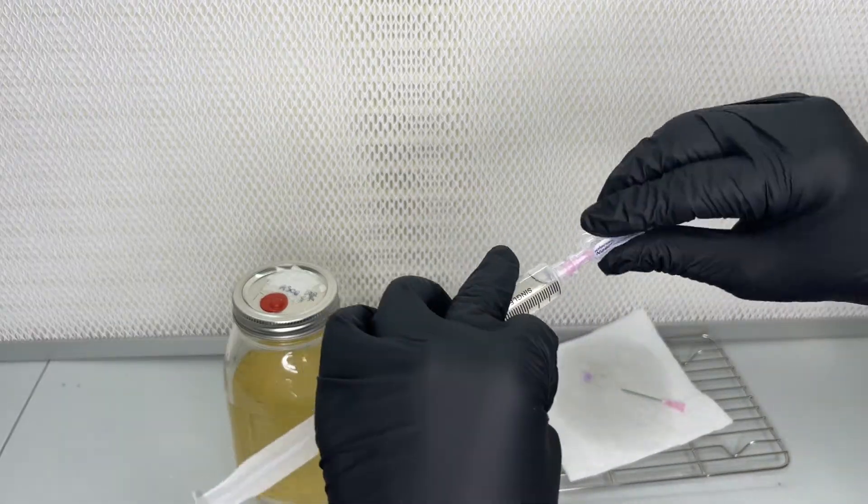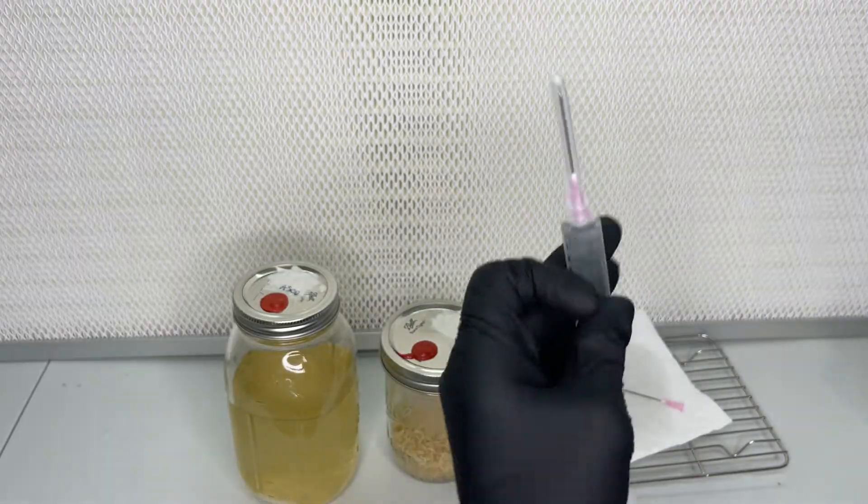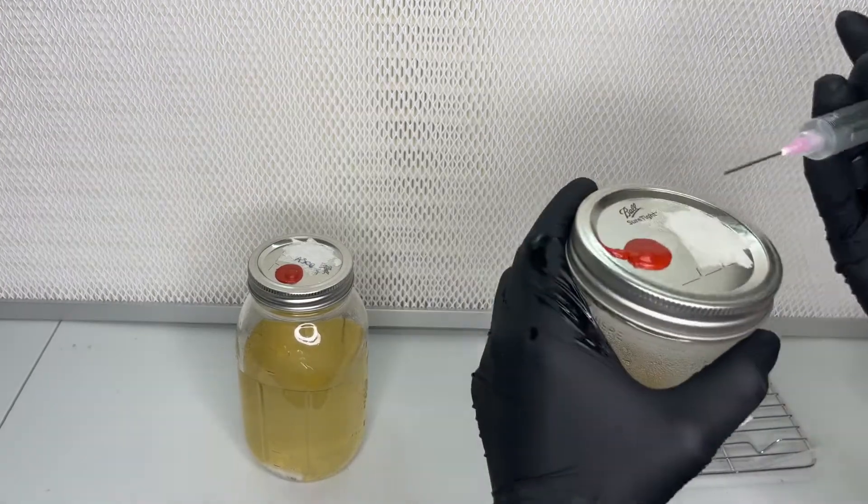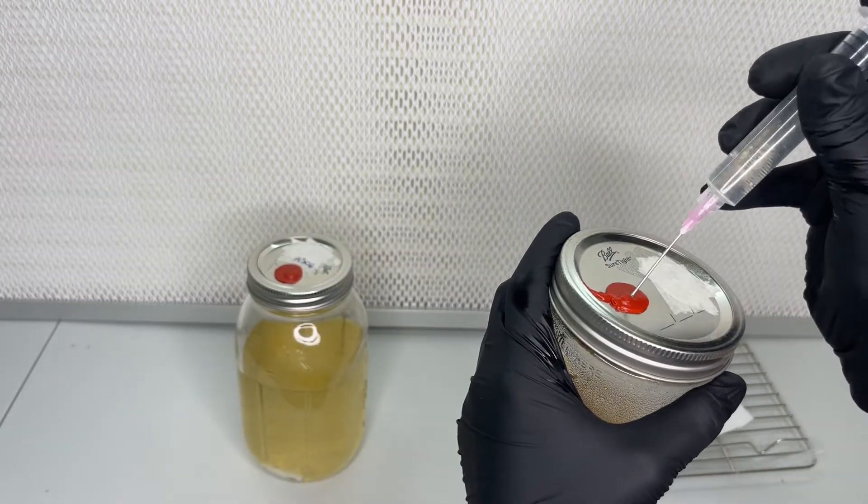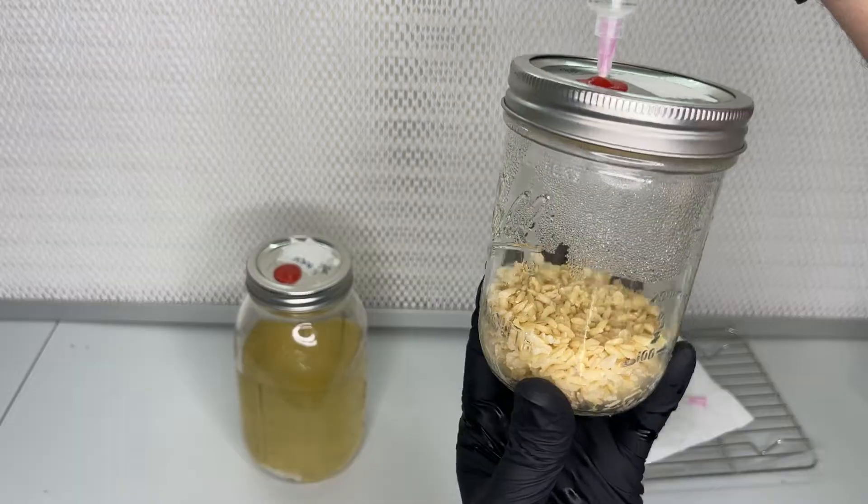After three days of colonizing, the jar is placed under LED lights for 12 to 24 hours per day. You'll know the culture is viable if you see pinning within 20 to 30 days.